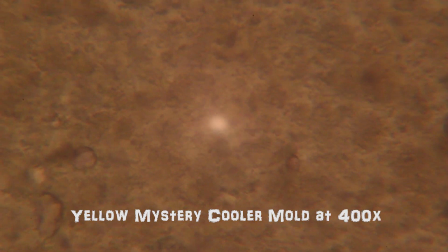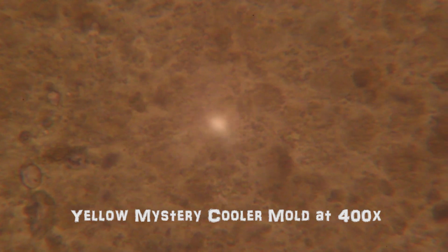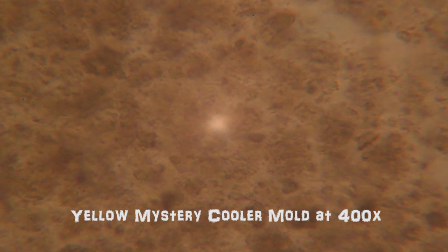It gets a little more difficult to focus, so please bear with me as I try to keep this in focus for us. The way I actually prepared these slides is I took the slide and put a drop of water on there, took a toothpick to the yellow and the green mold, separately of course, and put the sample in the drop of water. Then I covered it with the cover glass. Generally, you will use a type of dye to help bring some contrast to the image, which I don't have on hand at the moment and wasn't able to do at this time, but I will be getting some of that.